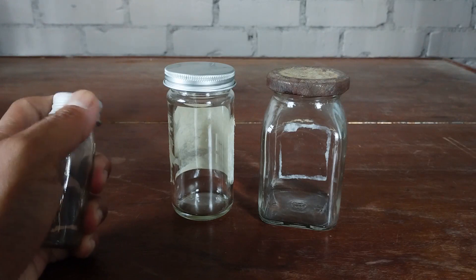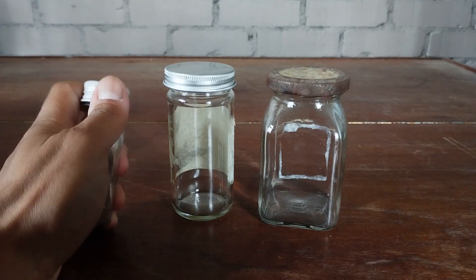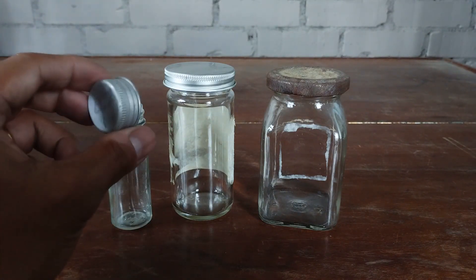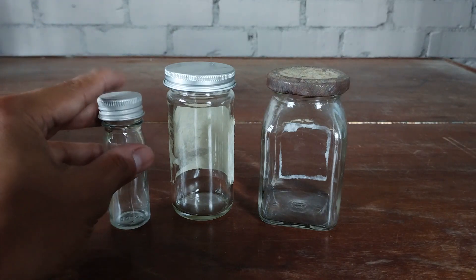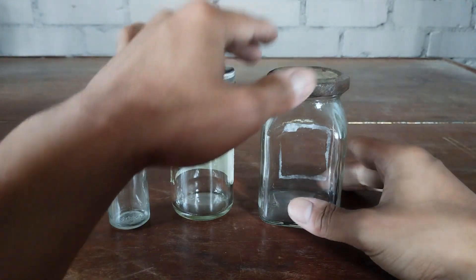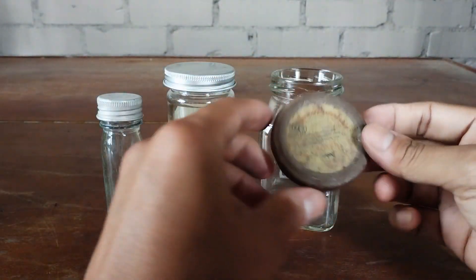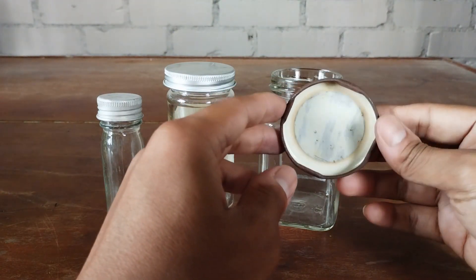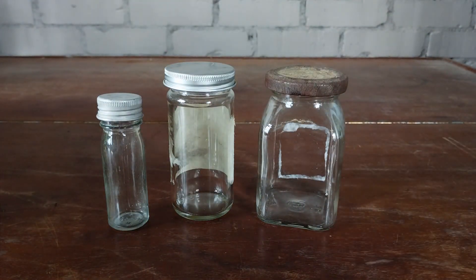Containers with metal lids, such as pickle and jam jars, may work only for short-term specimen storage. Preservative fluids — even ordinary water — have a detrimental effect on metals. As time progresses, the preservative will eventually corrode the inner surface of the metal lid while outside air corrodes the outer surface, resulting in the eventual disintegration of the lid altogether. In addition, rust that forms on the inside of the lid will sprinkle into the preservative fluid every time the container is moved or agitated, which could potentially destroy your precious specimens over time.